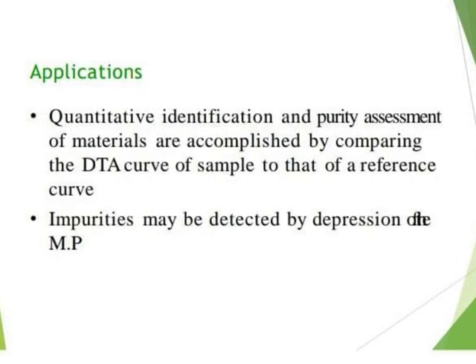Applications: quantitative identification and purity assessment of materials are accomplished by comparing the DTA curve of the sample to that of a reference curve. Impurities may be detected by depression of melting point.